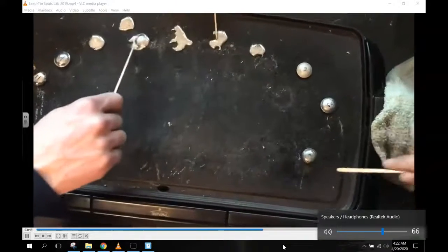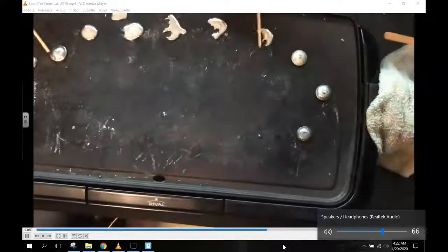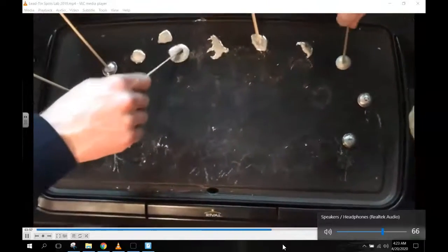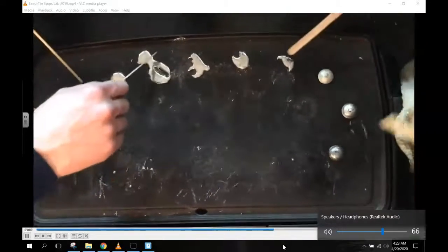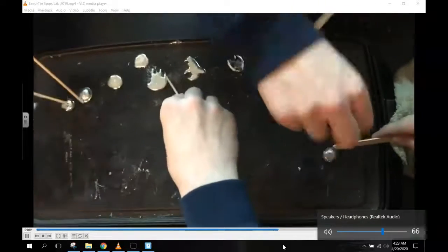Has any more gone? Oh, 7 just went. Did you see it go? It just was like, all of a sudden it was liquid. Number 1 just did that one. 3 is not gonna melt. Number 1 is gonna be the last one. No, 3 is.